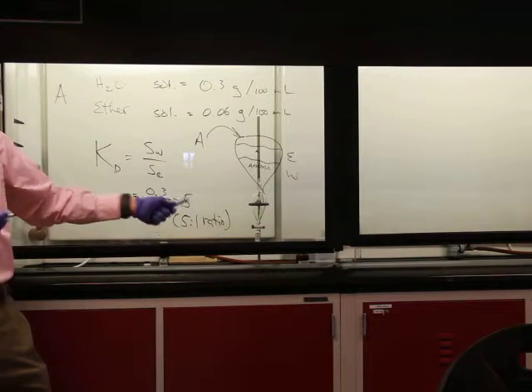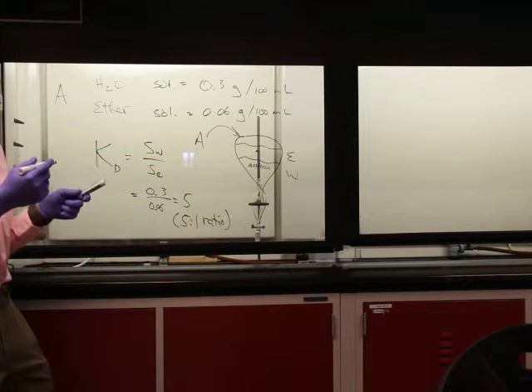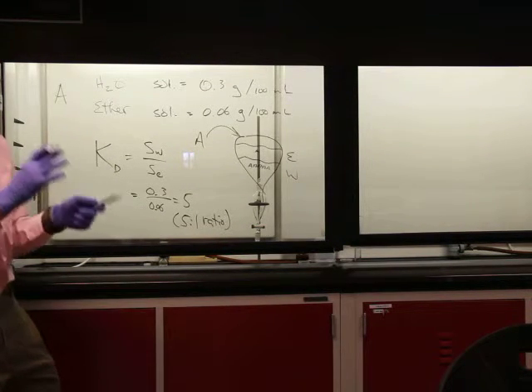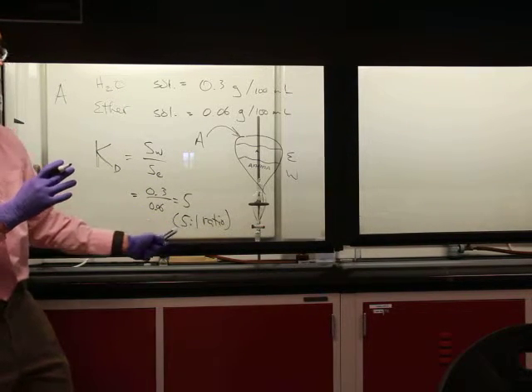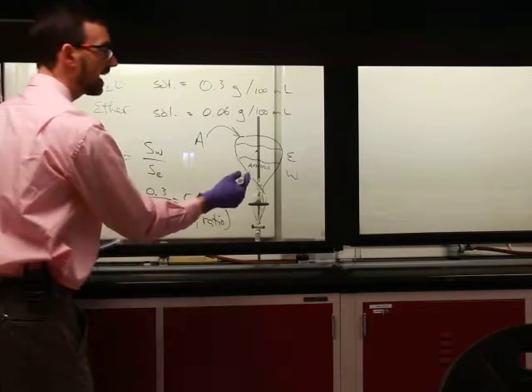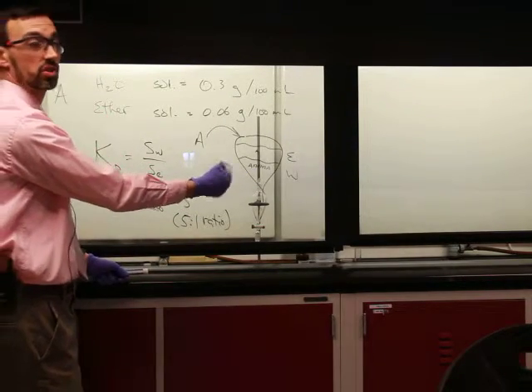All right. Now this contains right now a total of 6 molecules of A, as I've drawn it, right? So there's 6 parts, and they separate 5 parts to 1 part, so to speak. The ratio, the 5 to 1, you add those 2 numbers and it gives you 6 parts. That then tells me, well, what if I added 100 parts to here? Well, let's choose 90.